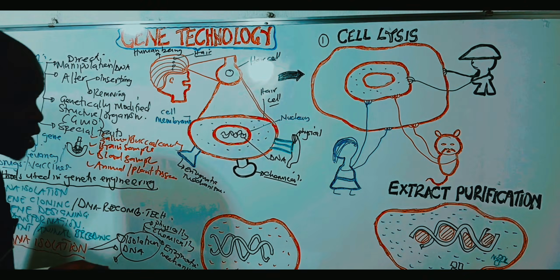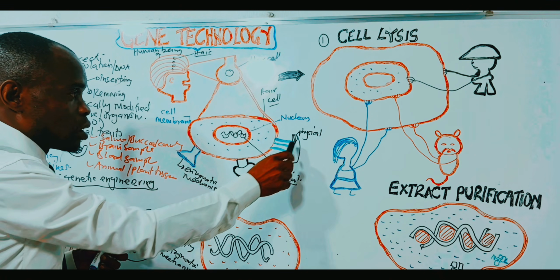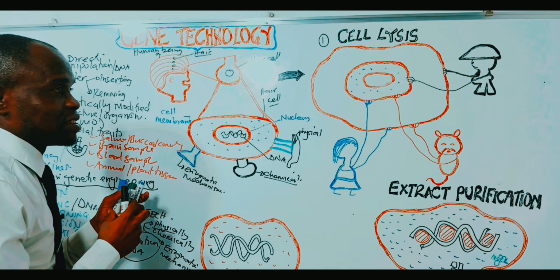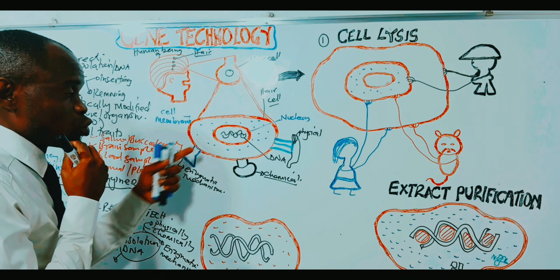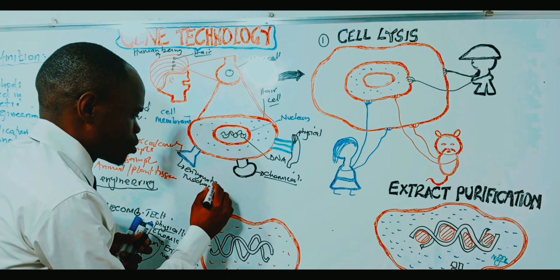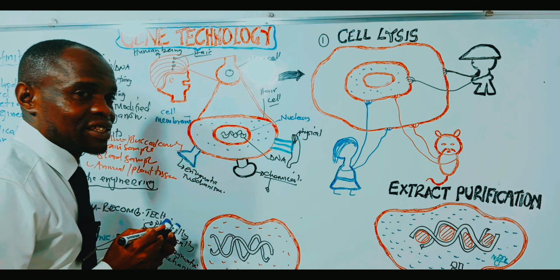Now, we have seen how the physical mechanism, the chemical mechanism and the enzymatic mechanism have been participating in trying to act onto the what? Onto the tissue here. But I want us now to look more at two mechanisms. We're going to focus more on what we call the chemical mechanism.